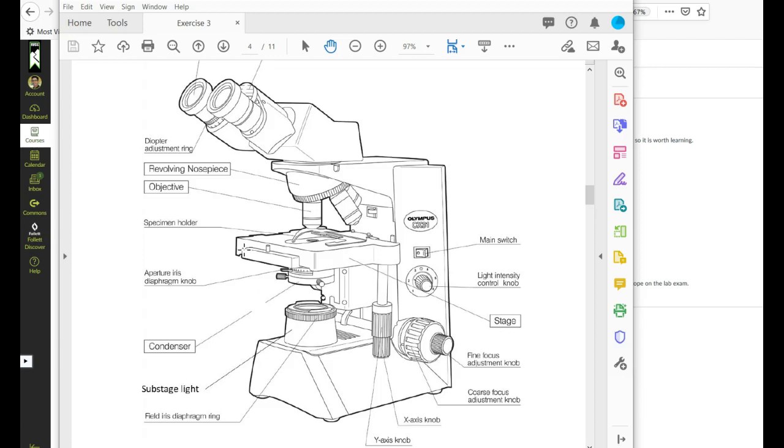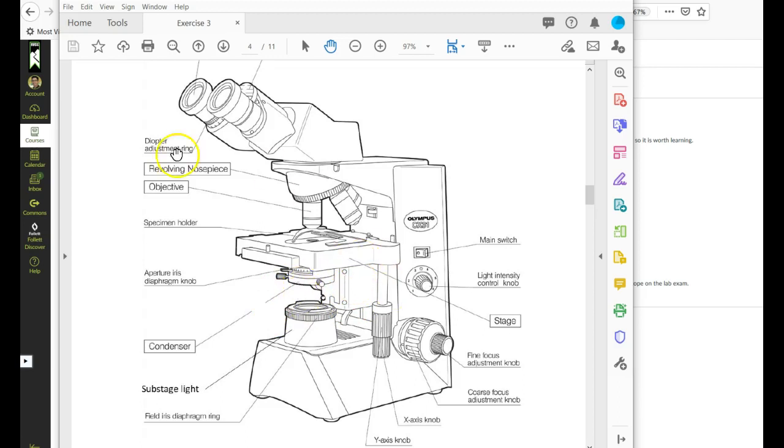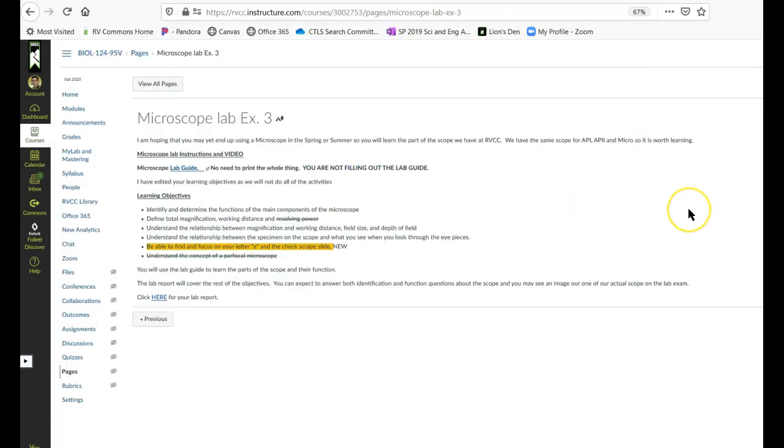Some of which might be simple identification, some of which might be what is the function of the thing I'm pointing to now? Or which of the things on this microscope here changes light level? Something like that. So I'm going to get creative with the questions so you can't just look at this figure and know how to answer them.